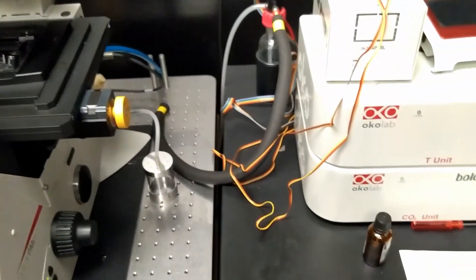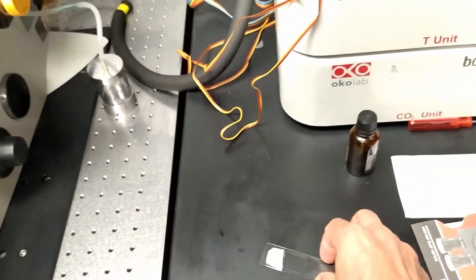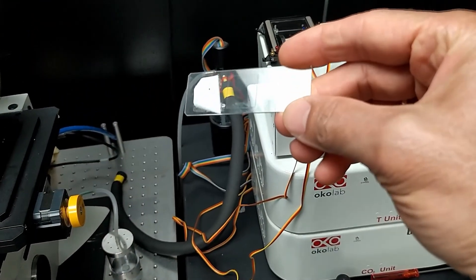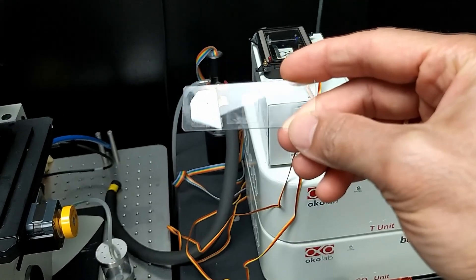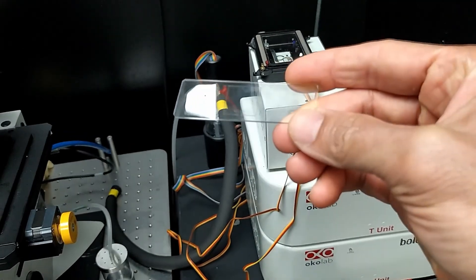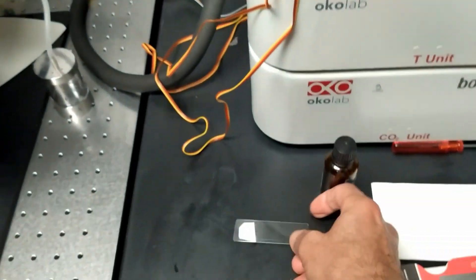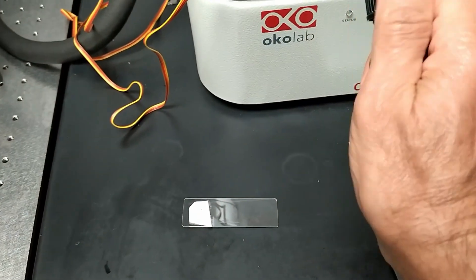Then grab your sample. In this case, I'm using a sample of cells grown on a coverslip and sandwiched to a slide. For fixed samples like this, it is best to put the oil directly on the sample.